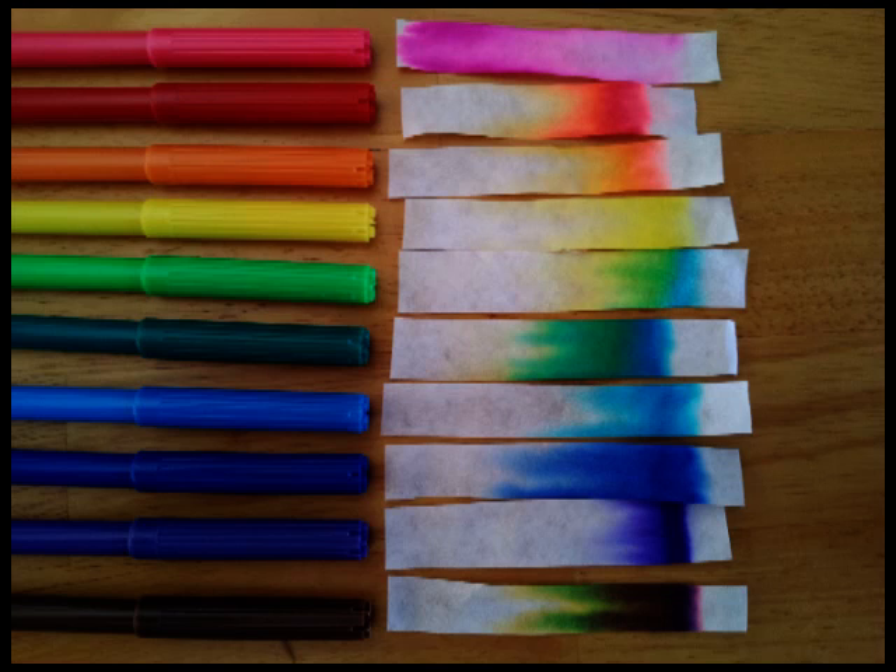Then you can measure how far it's moved and run that as a little bit of a race, with a prize for the group whose color traveled the furthest or fastest in that given time. That's a good point for discussion - some colors will move more quickly than others because some of these inks are more soluble than others. As the water gets drawn up the strip, some of the ink dissolves into the water and gets drawn up with it, travelling up the strip. Those inks that dissolve more easily will travel further, whereas those that are less soluble won't travel up as quickly.